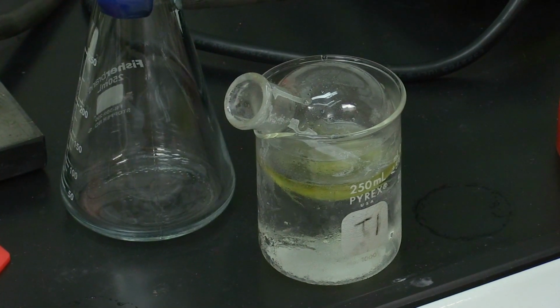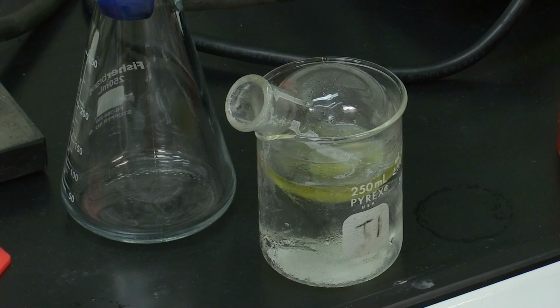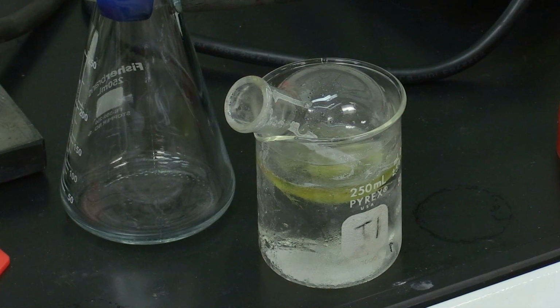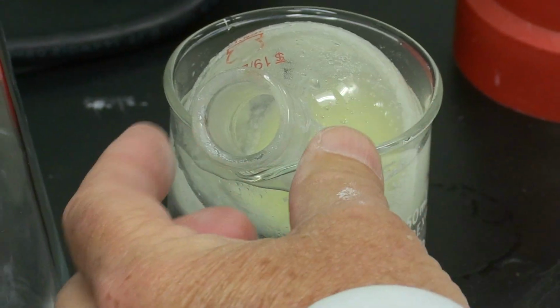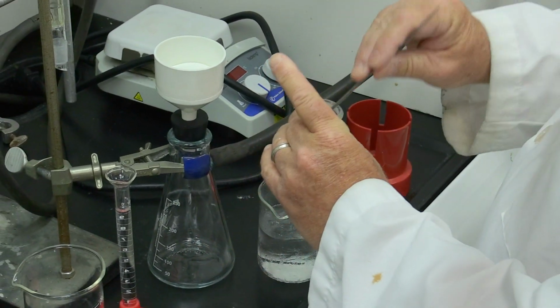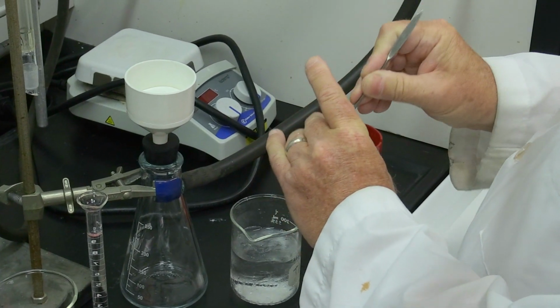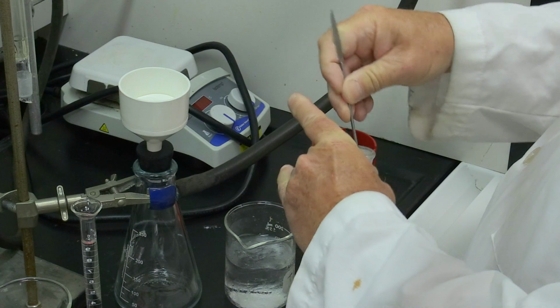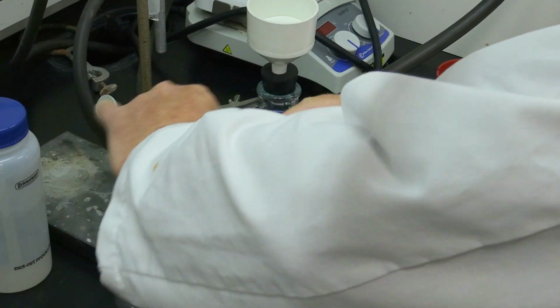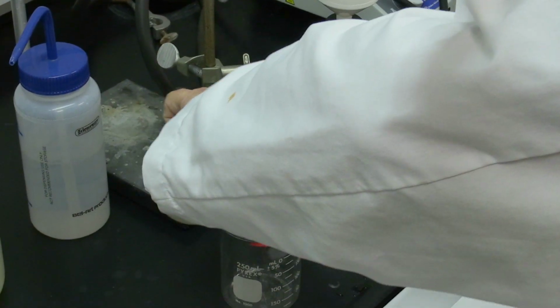Suction filtration. We've weighed the filter paper so we can get the weight of the product at the end. So it's cooled in ice bath till about room temperature, and you notice it formed a solid. So it's a little difficult to transfer, but we'll be able to do it. Got a lot of product, actually.